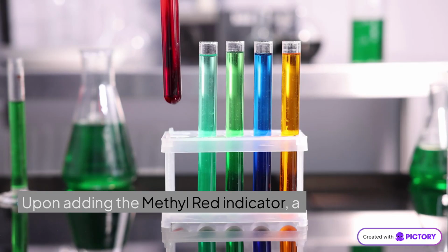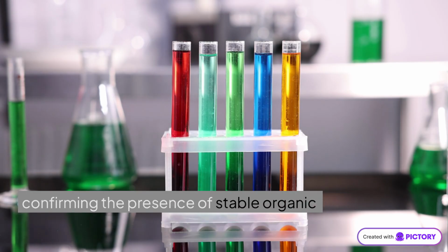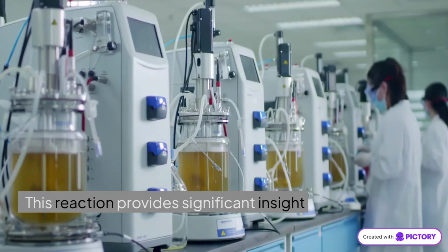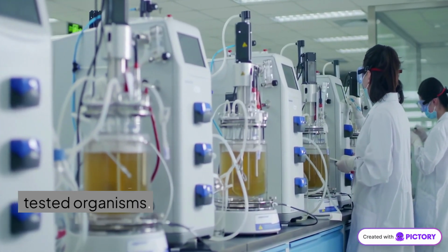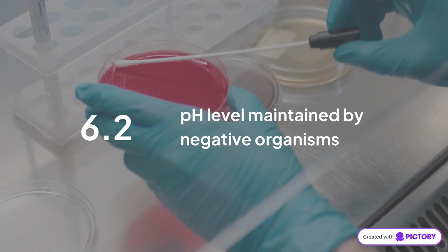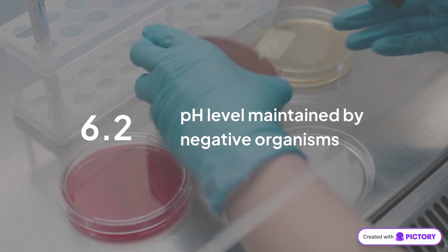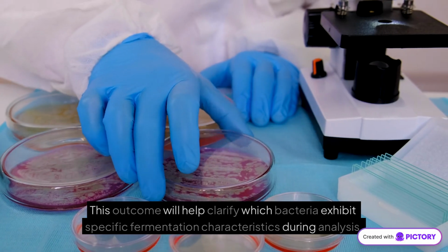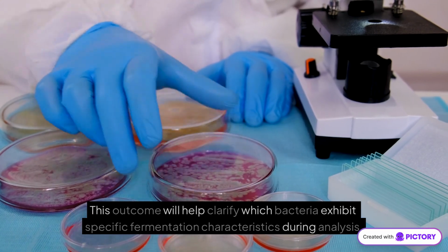Upon adding the methyl red indicator, a vibrant red color indicates high acidity, confirming the presence of stable organic acid production. This reaction provides significant insight into the fermentation capabilities of the tested organisms. Negative organisms produce neutral end products that maintain a pH above 6.2, resulting in the agar retaining its yellow color. This outcome will help clarify which bacteria exhibit specific fermentation characteristics during analysis.